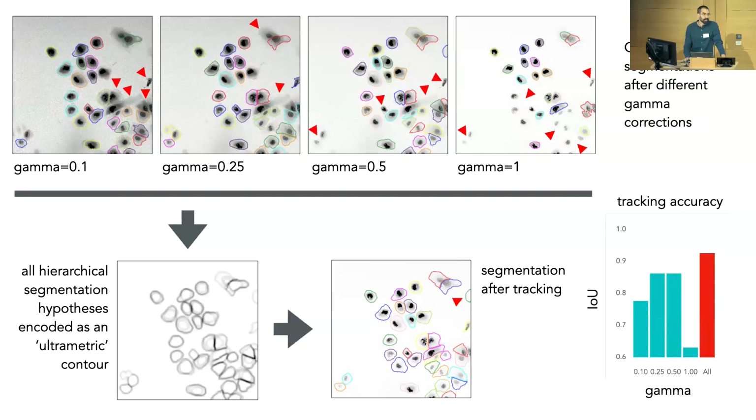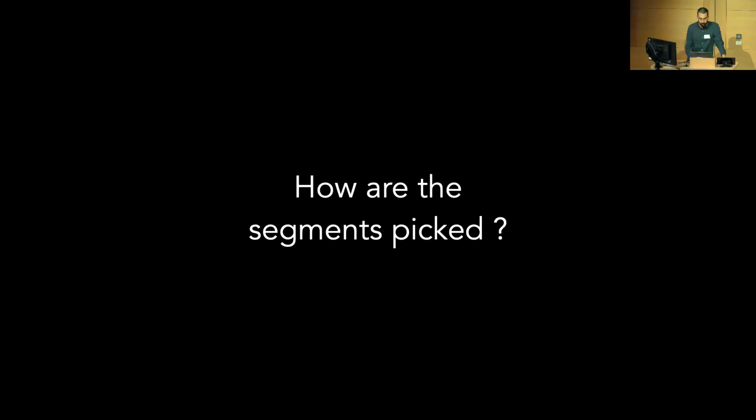In practice, a lot of times you won't have ground truth data. So tuning this parameter to get the best segmentation is really challenging. You might not be able to do that. So using temporal information to find your segments can be really powerful.